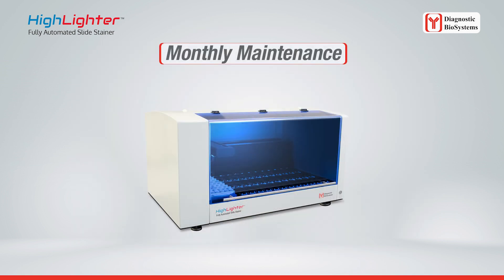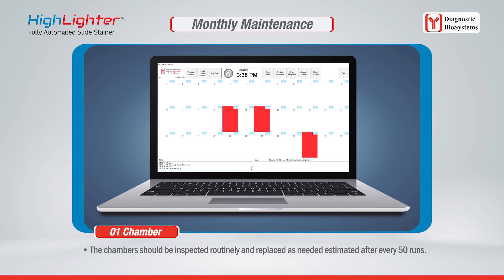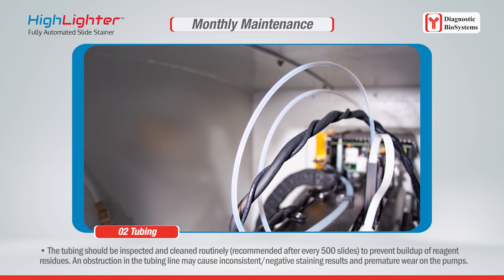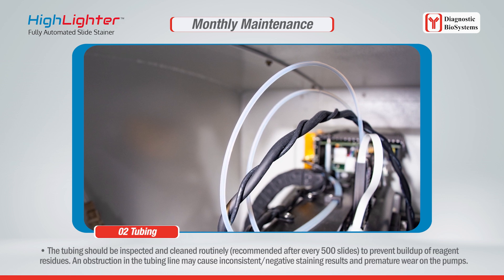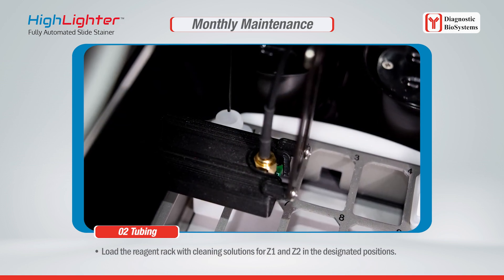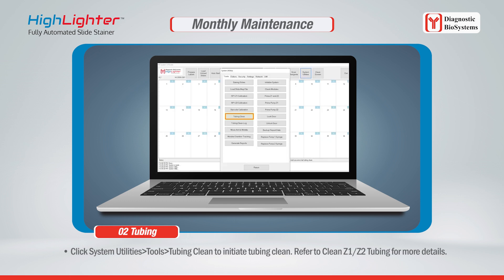For monthly maintenance, the chambers should be inspected routinely and replaced as needed — estimated after every 50 runs. The tubing should be inspected and cleaned routinely, recommended after every 500 slides, to prevent buildup of reagent residues. Obstruction in the tubing line may cause inconsistent negative staining results and premature wear on the pumps. Ensure the buffer container is filled and connected to the tubing, and load the reagent rack with cleaning solutions for Z1 and Z2 in the designated positions.